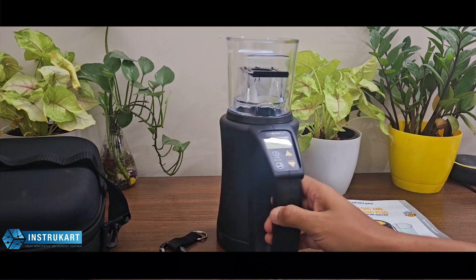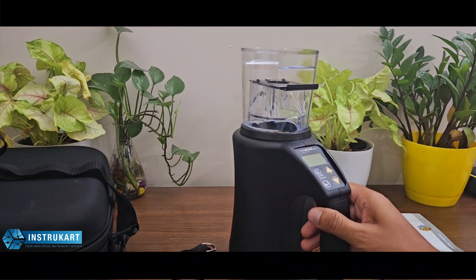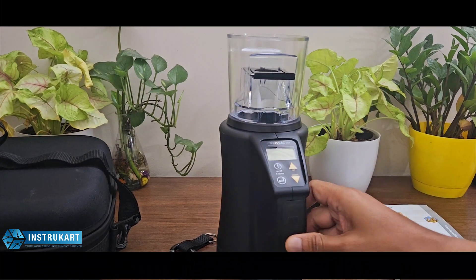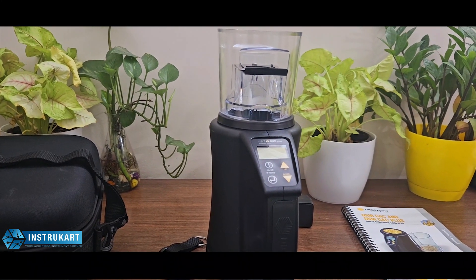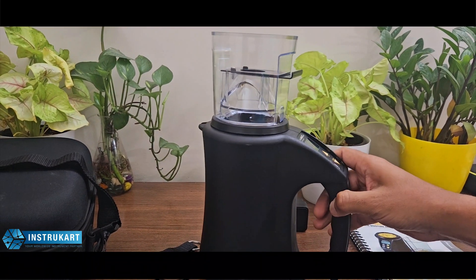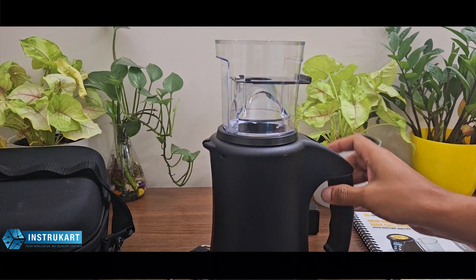This moisture meter is unique in its kind and has many features. The models in this family are the M mini GAC and GAC plus, each having different specifications. However, the GAC plus has a better feature — it includes a weighing scale along with the moisture meter.